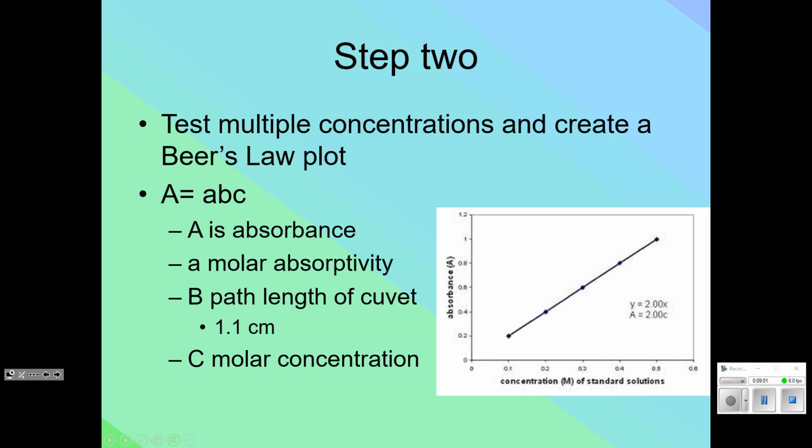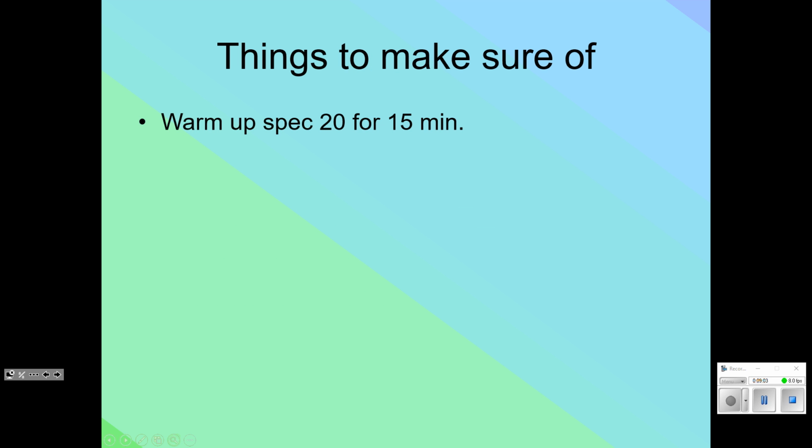My last slide is more about the spectrophotometer. Even now, when I look at that window, it says warming up. It says you can press the button to skip, but that bulb needs time to get warmed up and get to a good position. So whenever we do spectrophotometry, we need to get these things started right away, because it determines when we do our work. Next class, we're going to have to do some dilutions. Remember, M1V1 equals M2V2?